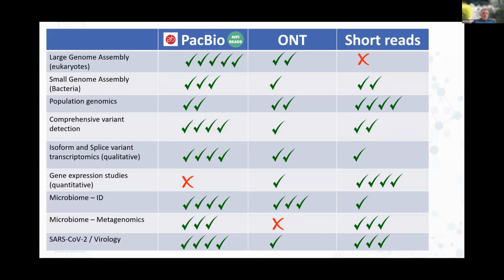With the type of probe technology that PacBio is using, it is nowhere near as prone to problems with coverage because of new variants popping up.